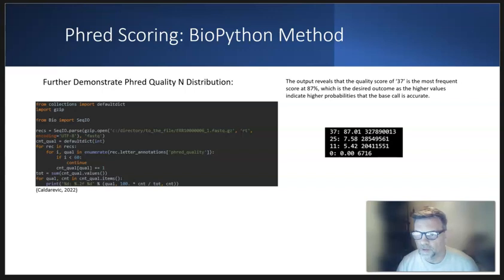The following Python code parses the FASTQ file to investigate the Phred quality distribution even further. Then it iterates over the dictionary of unique Phred quality scores to increment by 1 for each new Phred score. The totals are calculated for each unique score and converted to percentage fractions of the total amount of nucleotides found within the sequences.